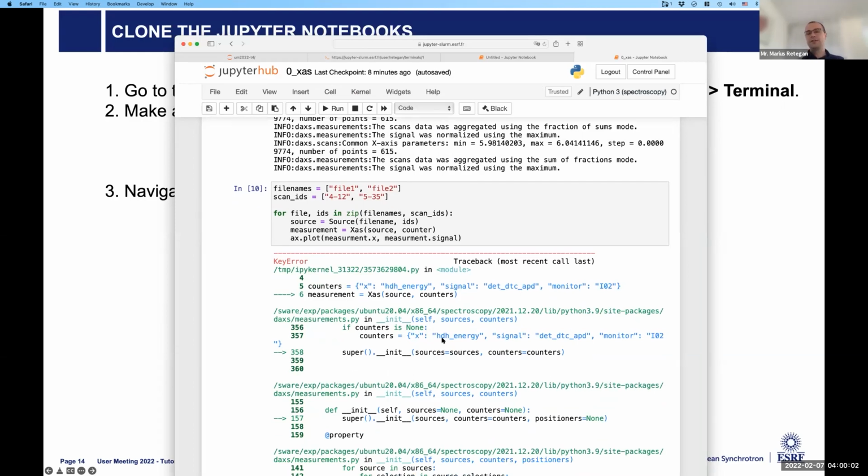Then I think it's easier to adapt to the use case, and you gain a lot in terms of how quickly you can analyze all this data. I agree with you because it's a bit complicated, but I think there is a lot to be gained by using this type of approach to analyze data. As I said, my perspective is not the best, but let's see. This is the reason why I'm just watching this presentation.